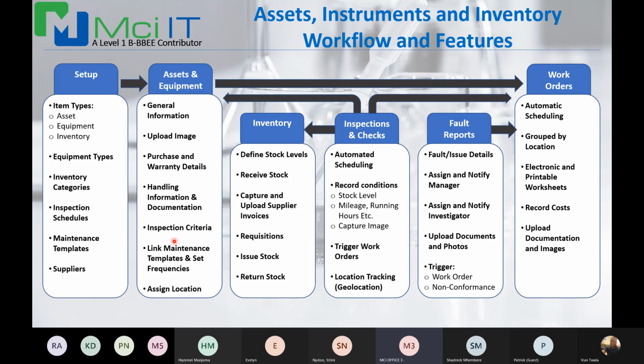Now, in terms of inspections and maintenance, we divide that into two. I can easily take a piece of equipment that needs to be calibrated or serviced every 12 months. That's quite easy because I just work 12 months off of the last service. In the system, like we had compliance elements for personnel, you can set up maintenance templates that you can then link to the equipment: an annual service, a daily check, a weekly verification, or cleaning it. There's no limit. I'll demonstrate that just now.